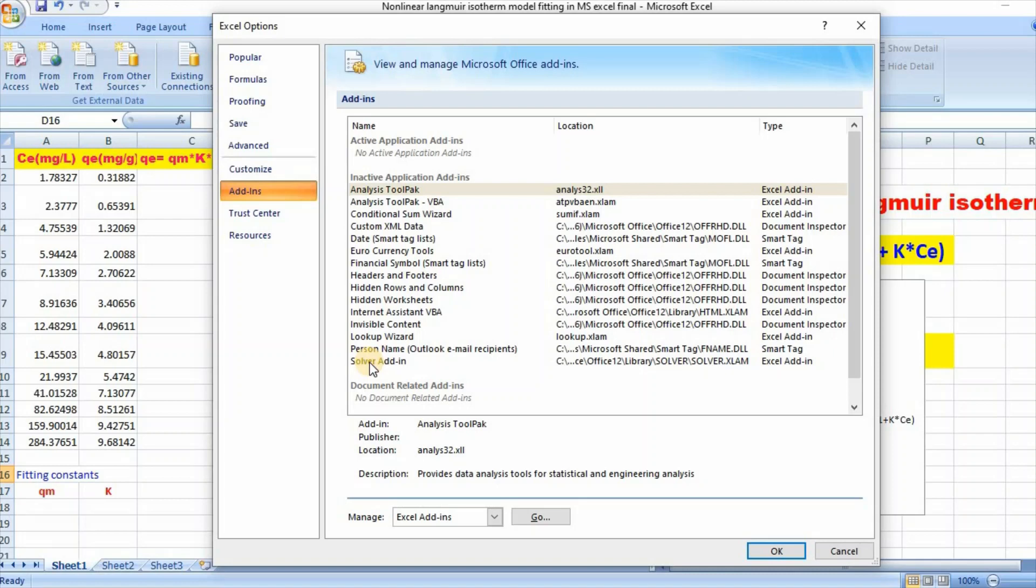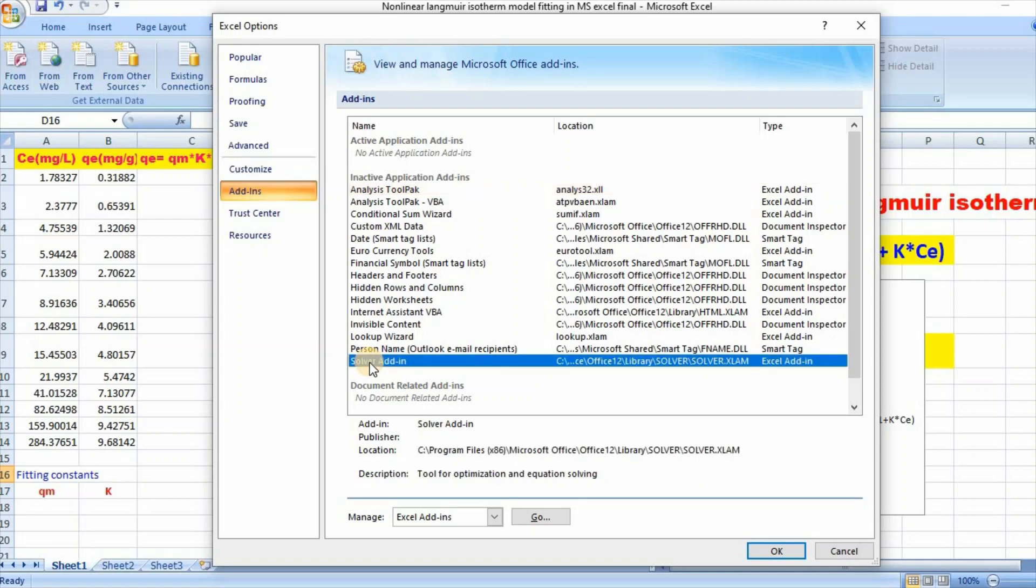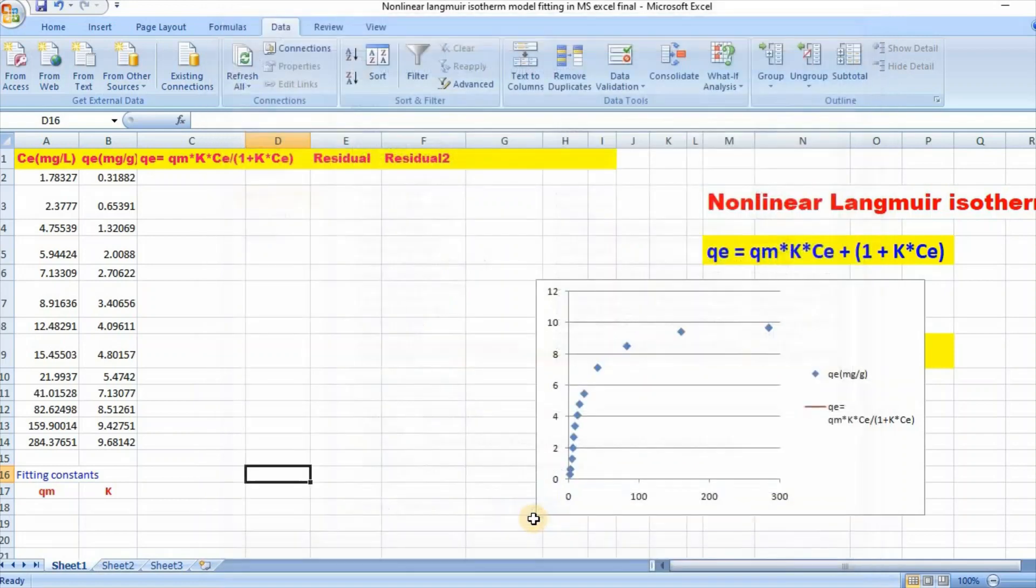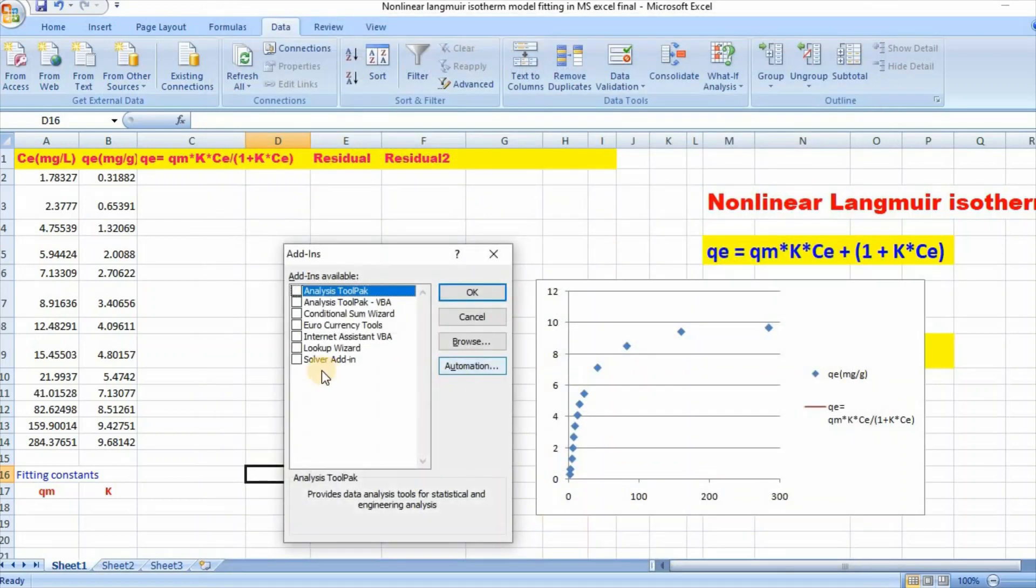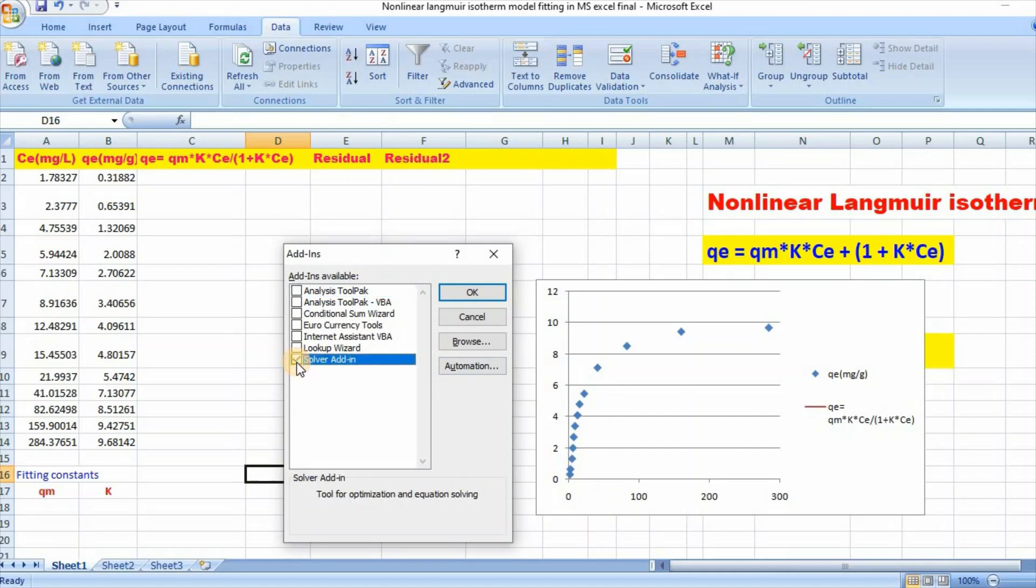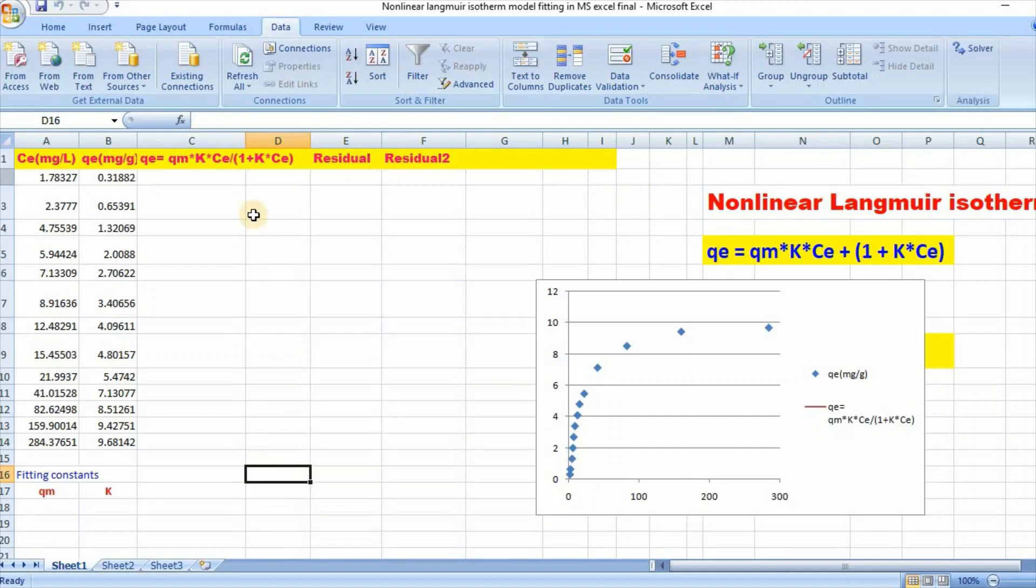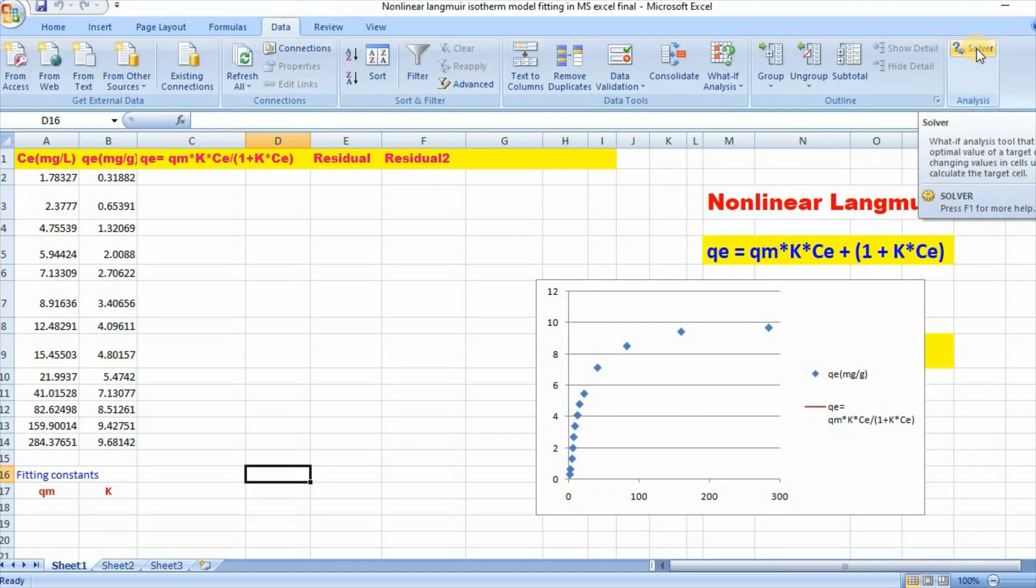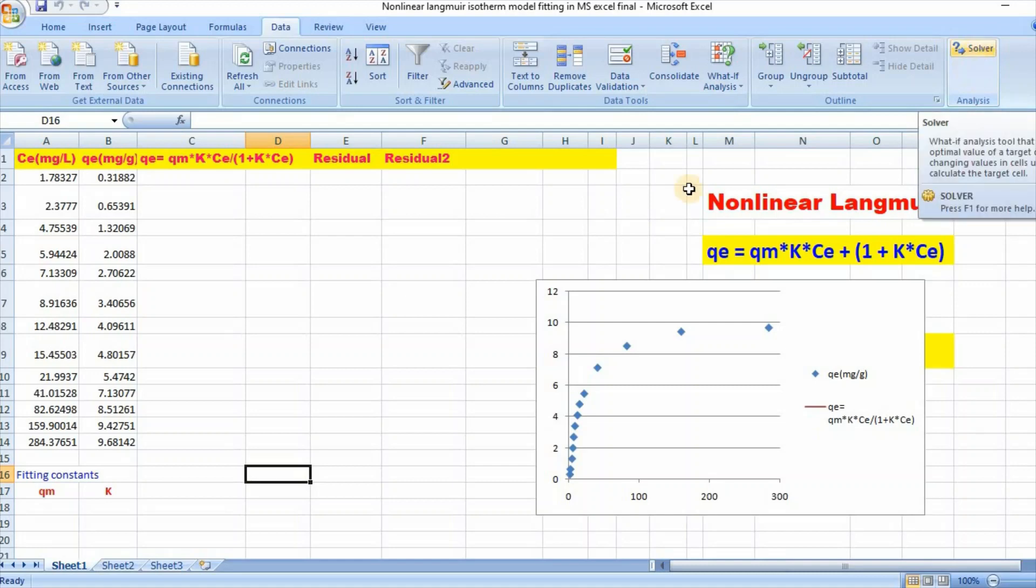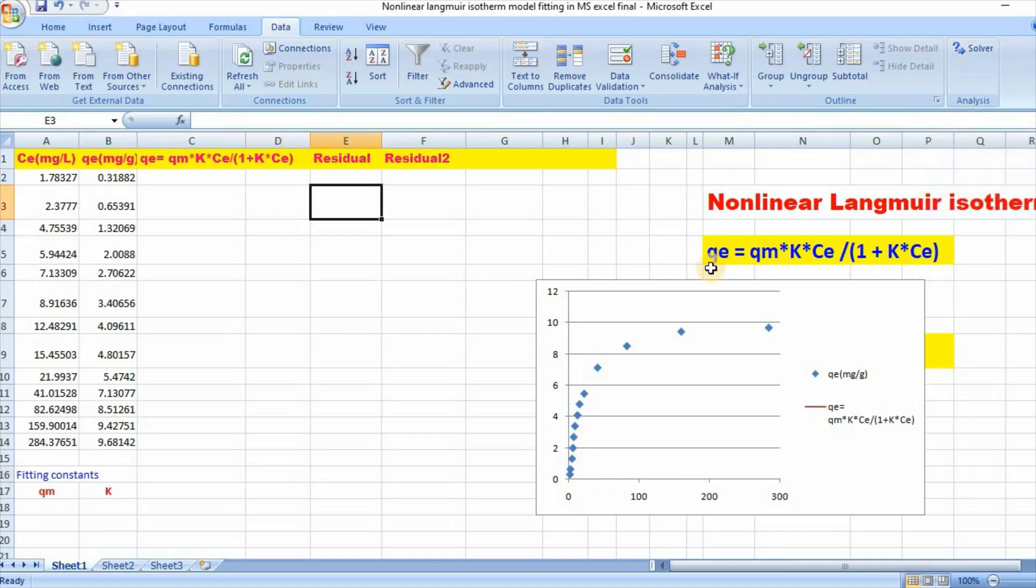Then click on Solver Add-in, then Go, then click on Solver Add-in, then OK. If you click on Data, then Solver will appear. So here is our Solver. Nonlinear Langmuir isotherm can be written as qe equal to qm K Ce divided by 1 plus K Ce.